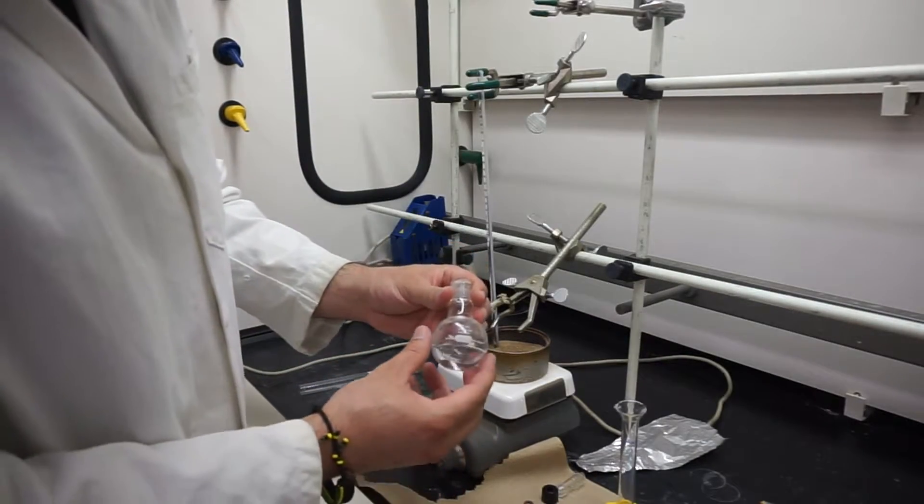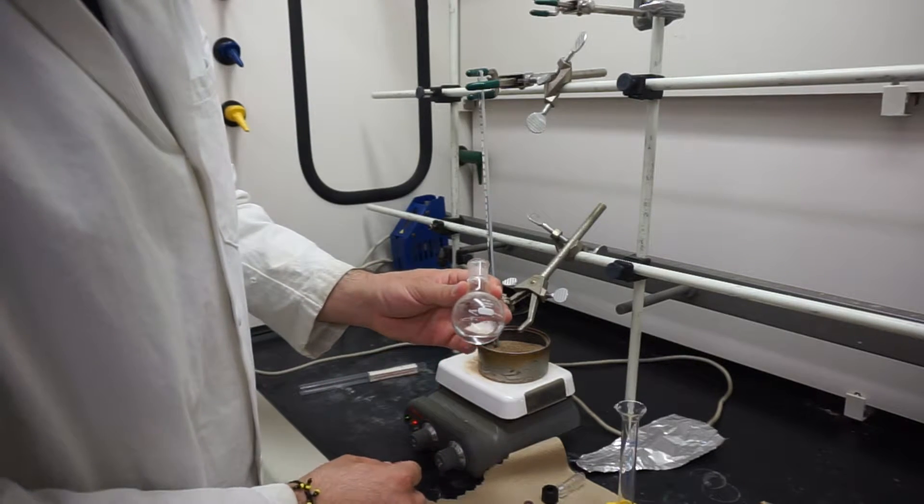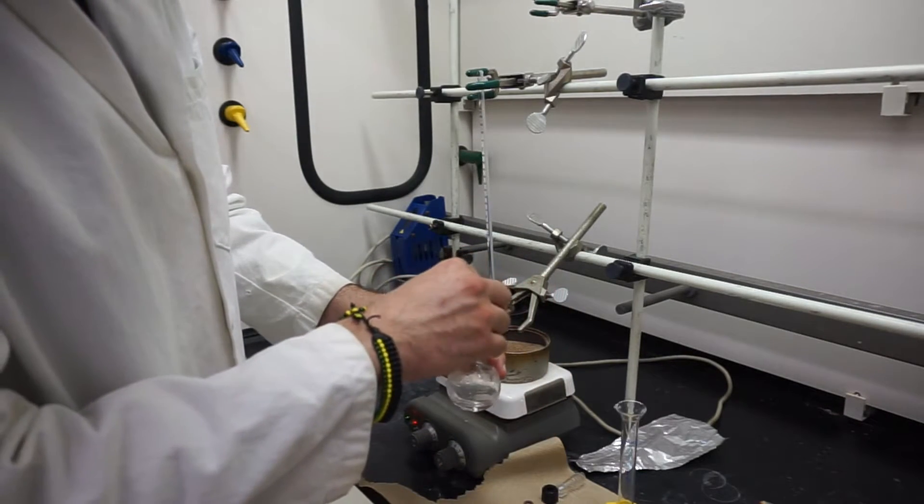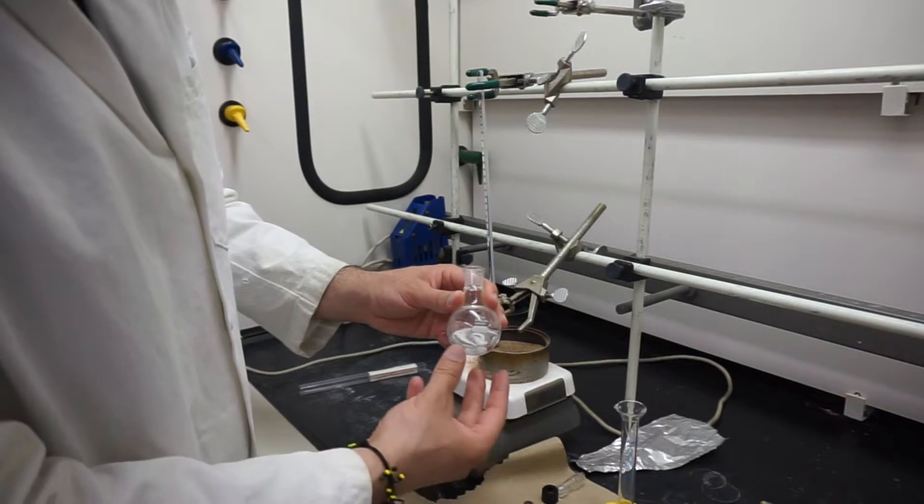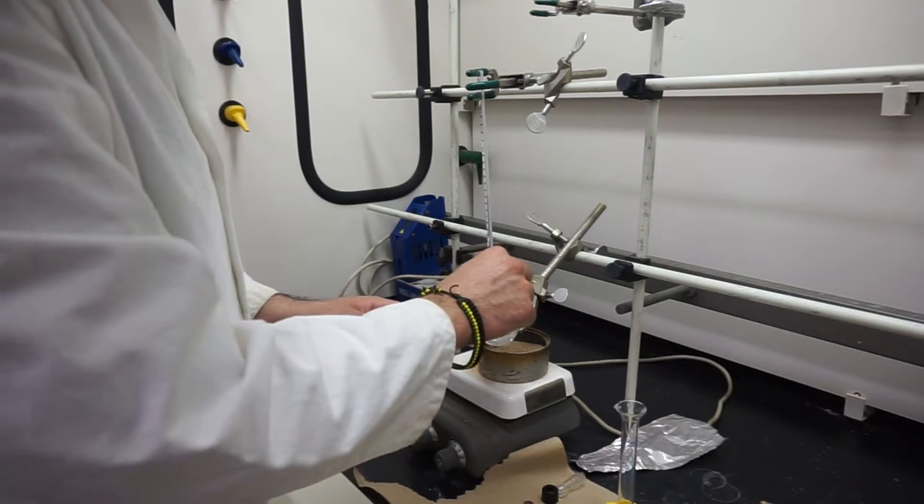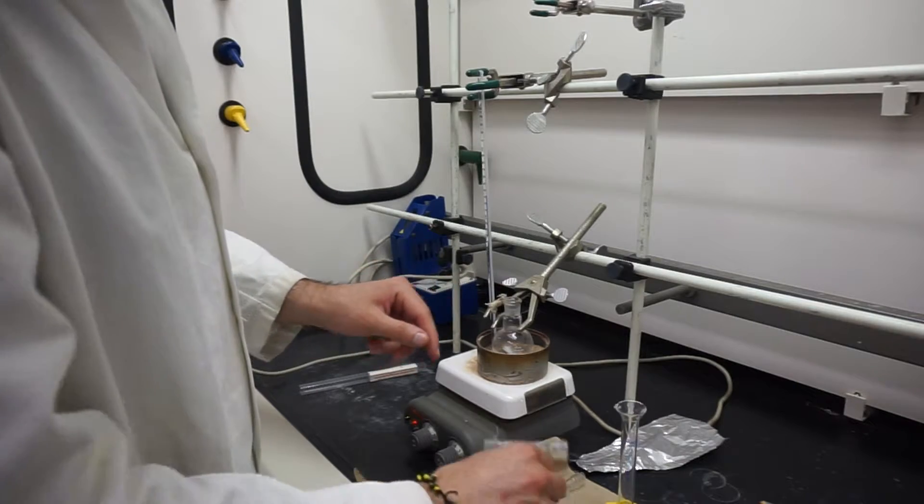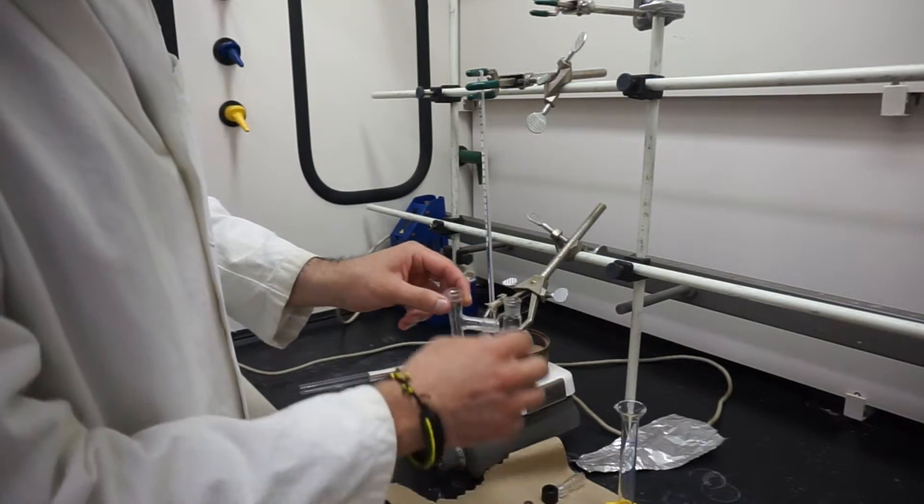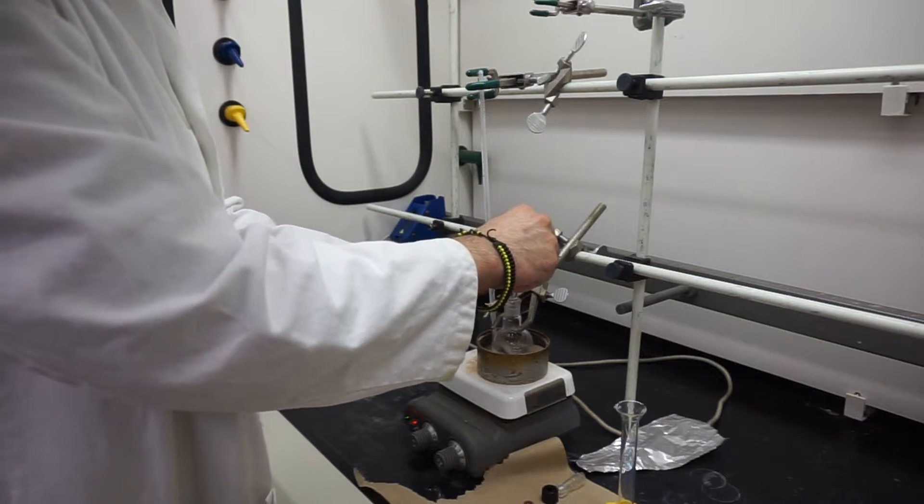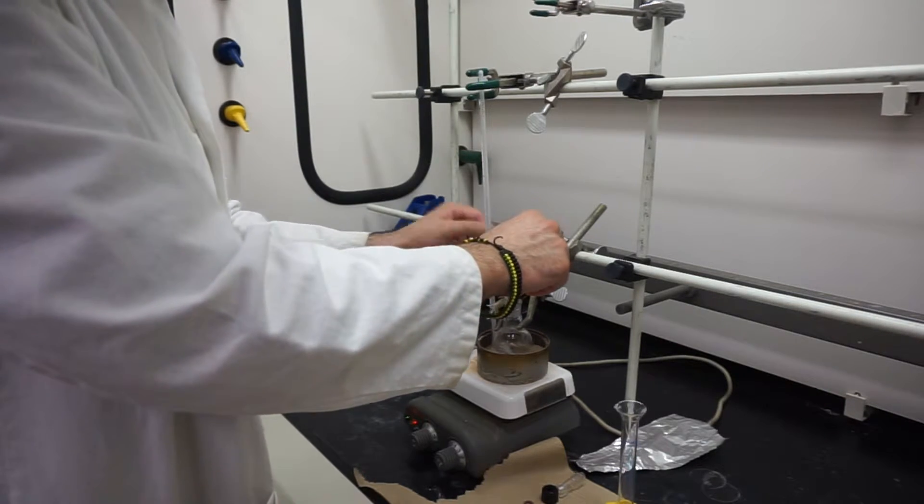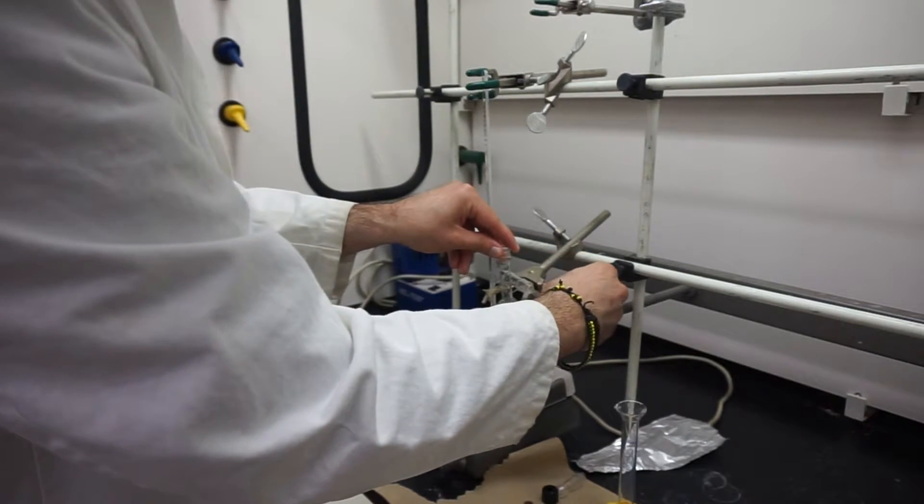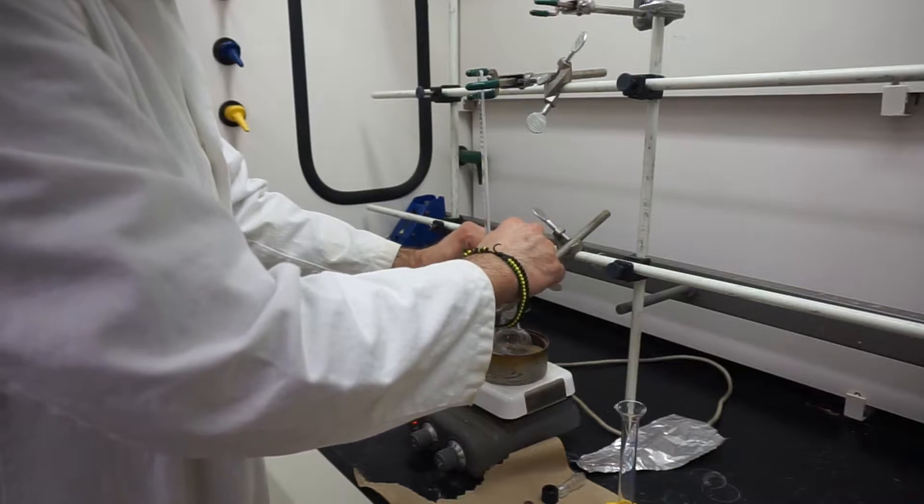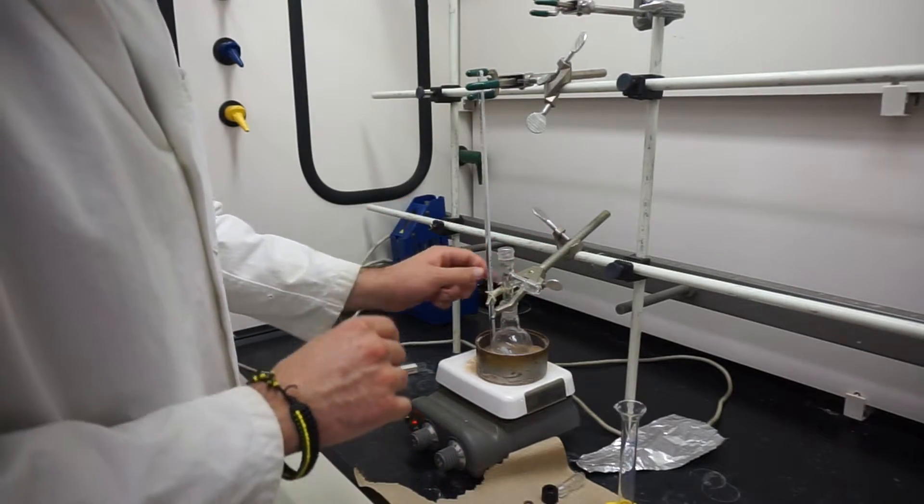The first thing we're going to do is take our round bottom flask with our solvent in there. Today I'm just using water, but use whatever solvent you're going to be using. I'm going to put my stir bar in there—typically you're going to have your stir bar in there before you add your solution. We'll take our three-way distill head, put just the smallest amount of grease on it, and put that over the top. Once that is attached, we'll clamp them together to make sure it's stable.